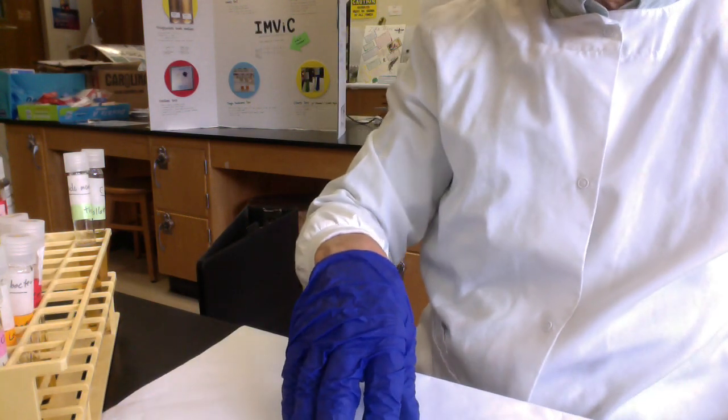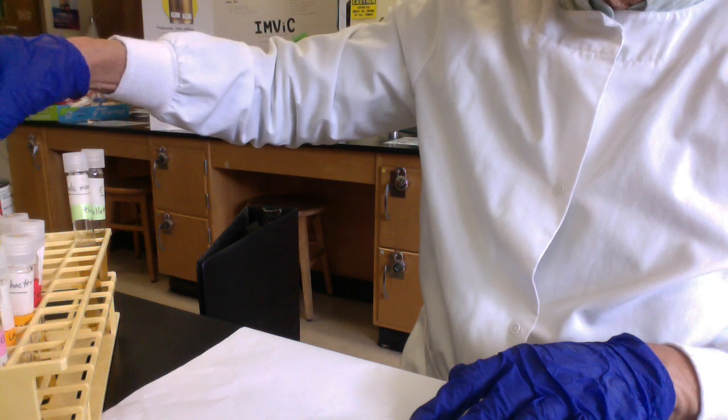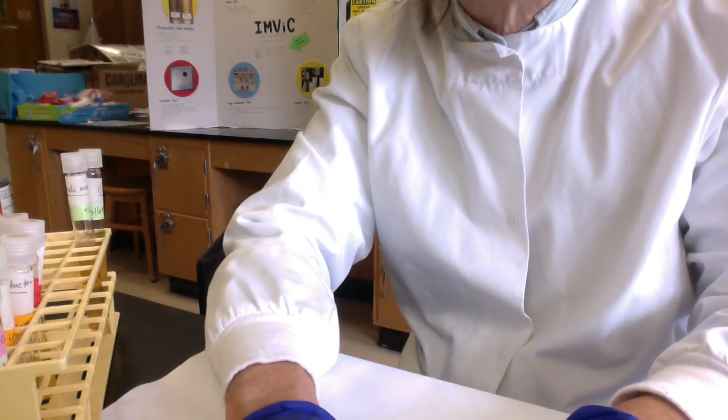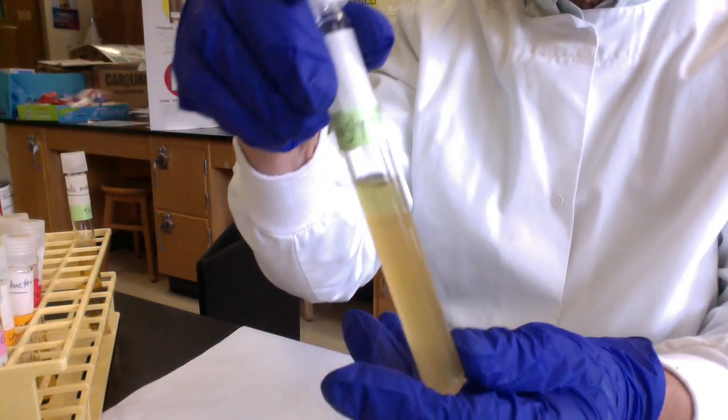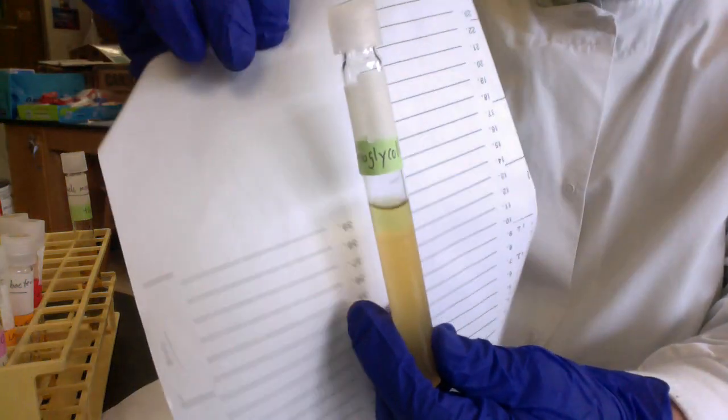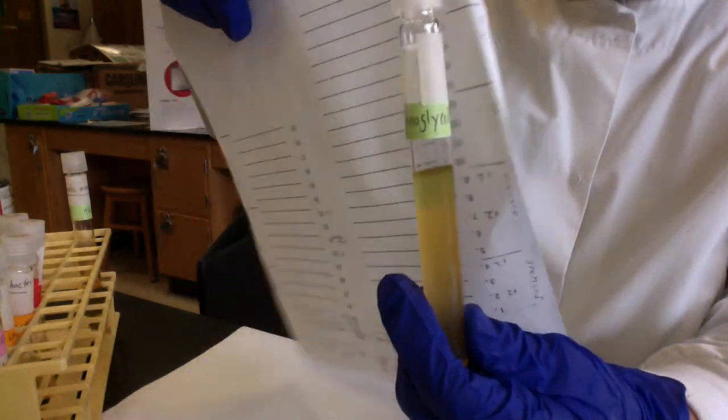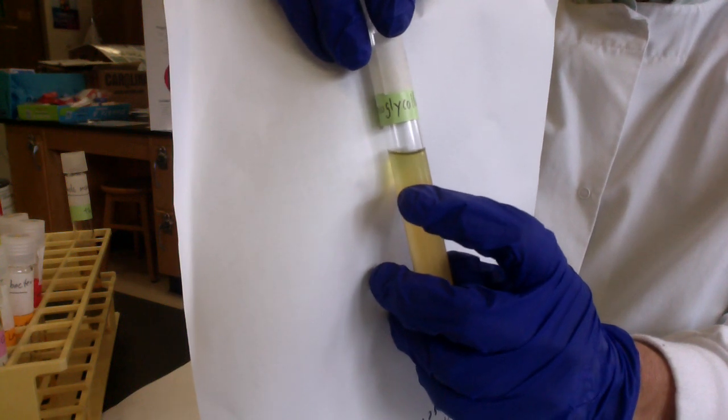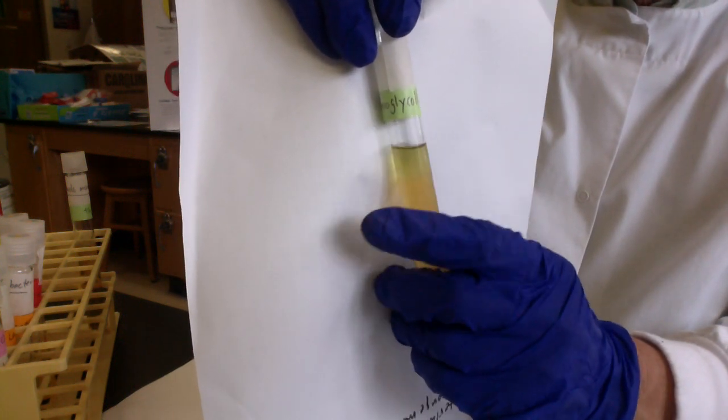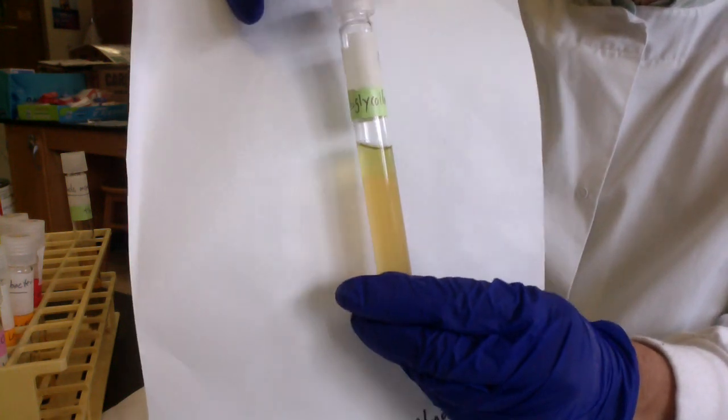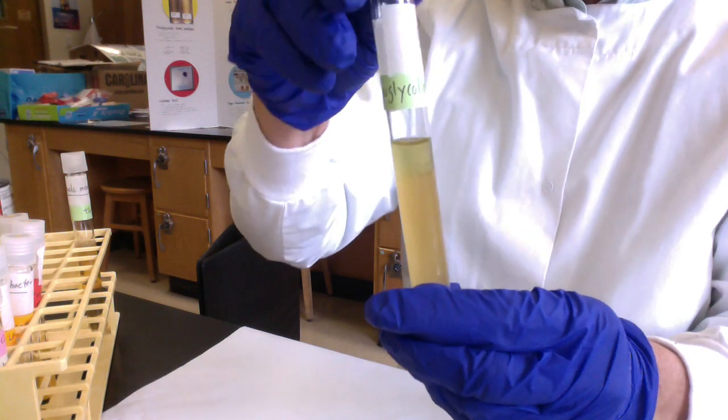In Chapter 16, we also inoculated thioglycolate media. Thioglycolate reduces molecular oxygen. At the top, there's a green zone—an oxidation-reduction indicator. Where it's green, oxygen is present. Down below is totally anaerobic from the thioglycolate reducing molecular oxygen. We look at the pattern of growth without shaking the tubes.